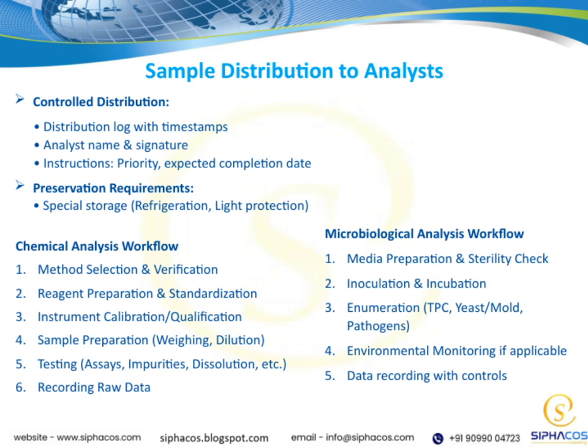If applicable, we also conduct environmental monitoring to verify that our surrounding environment remains clean and contamination-free. Throughout this process, accurate data recording is essential, and we incorporate controls to validate our results.